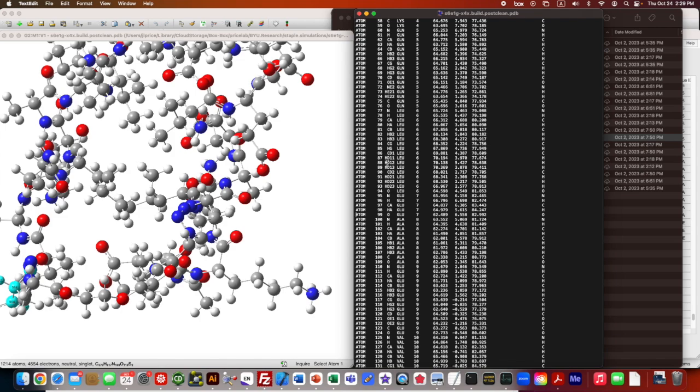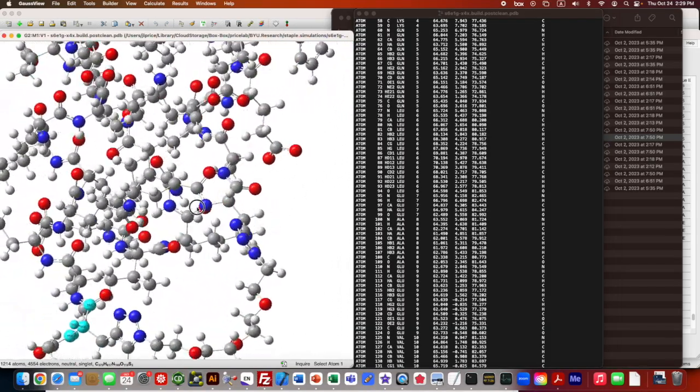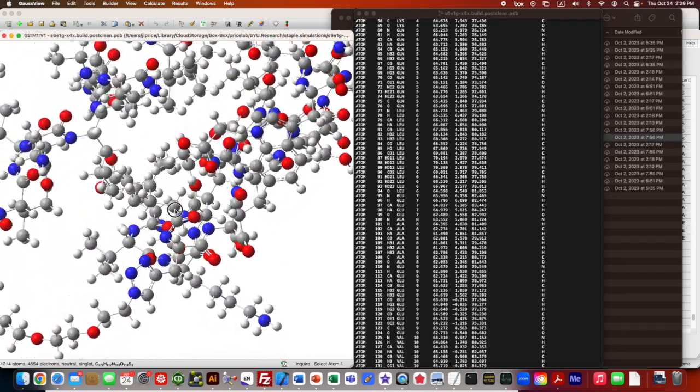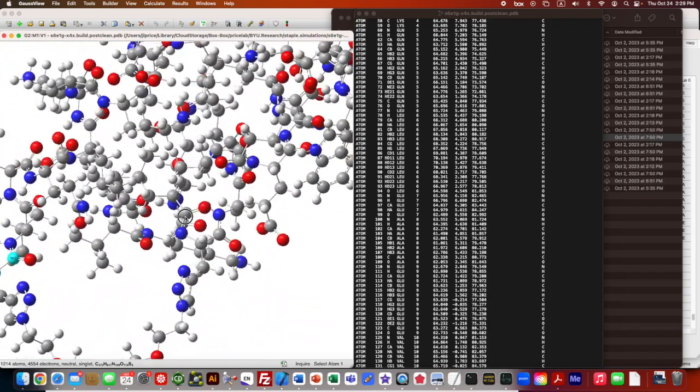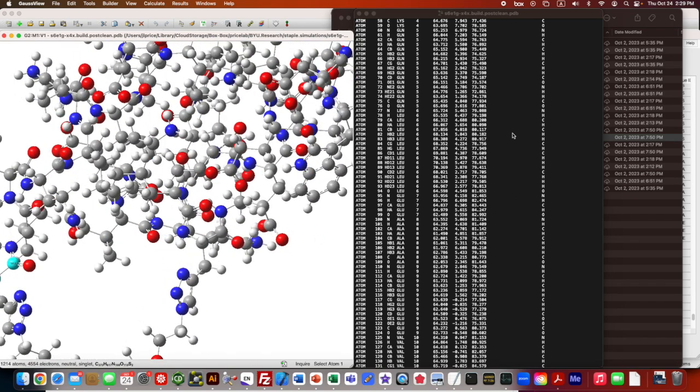Also lost it for the other one. It is there, so that's weird. And we may need to find it.